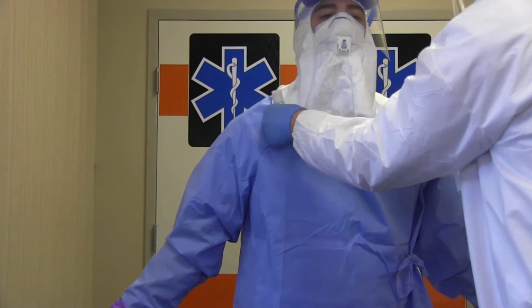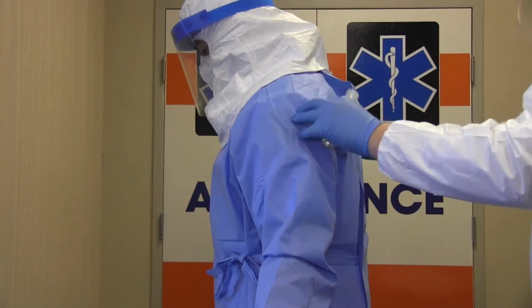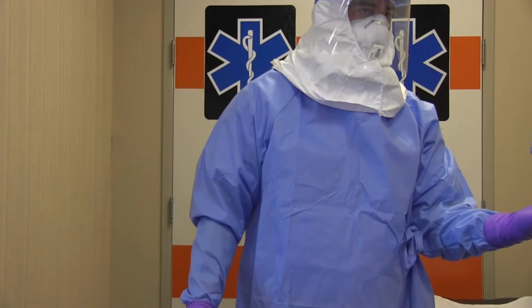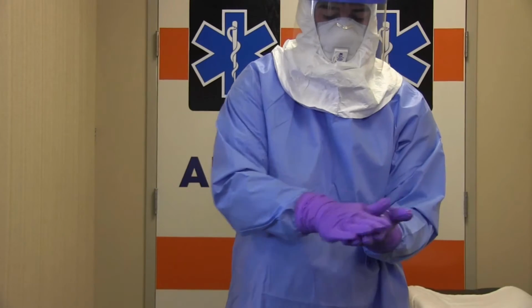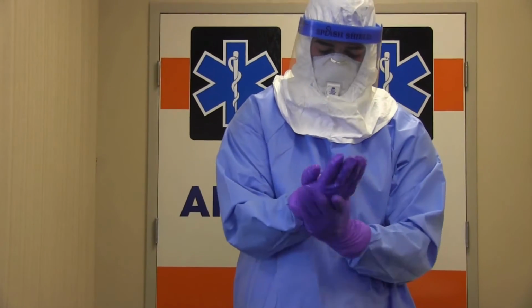After completing the donning process, you should ensure that you can move comfortably and have a full range of motion. Your trained observer should ensure all PPE has been donned appropriately, and any corrections can be made at this time. Once all the PPE has been donned appropriately, disinfect your outer gloves with an alcohol-based hand rub and allow to dry prior to patient contact.